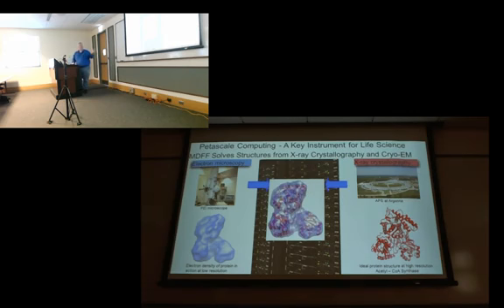VMD can also show the results of hybrid fitting methods. I think you'll hear about MDFF sometime this week. Is that right, Joel? Yes. Okay, so you got a little intro about it already. So this is another nice thing that VMD can do. You can actually load your MDFF simulation trajectory and watch your fitting progress.